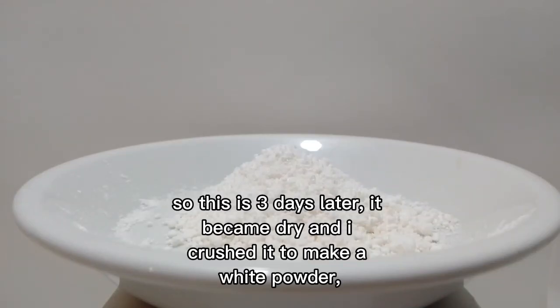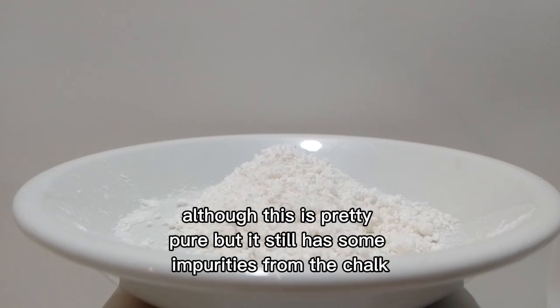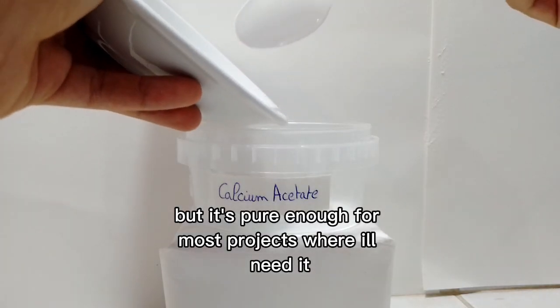This is three days later — it became dry and I crushed it to make a white powder. Although this is pretty pure, it still has some impurities from the chalk. But it's pure enough for most projects where you'll need it.